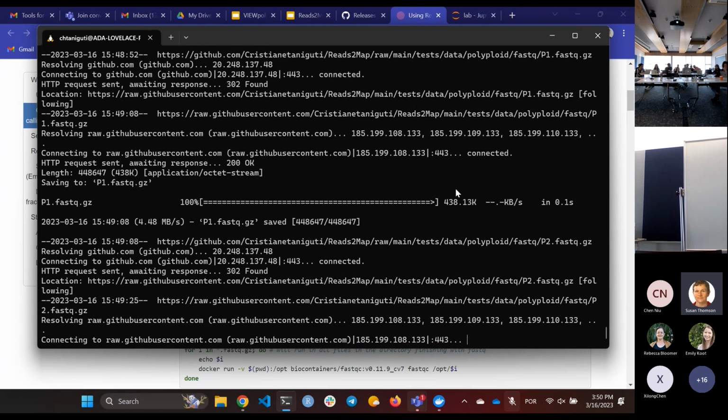So I think it's gonna. And the bar. And the, not the pipe, the one that's angled. That's okay, now you can try again. Someone in my user. And Reads2Map 2023, and then you should access. Should be 7. No, you're in user 35, there you are. Do you have it? I have the full link. I tried to email it, but it's not going. Okay, you have the bar, just put the bar. Yeah. That is why I can't do it.